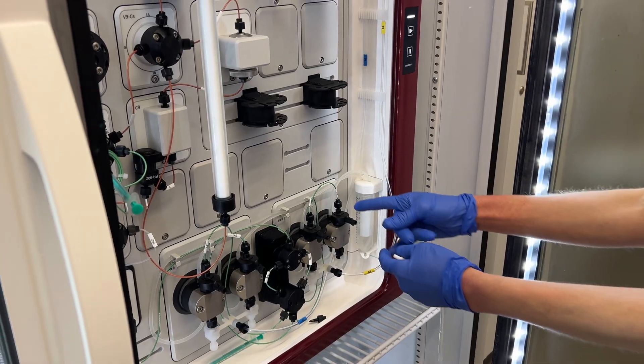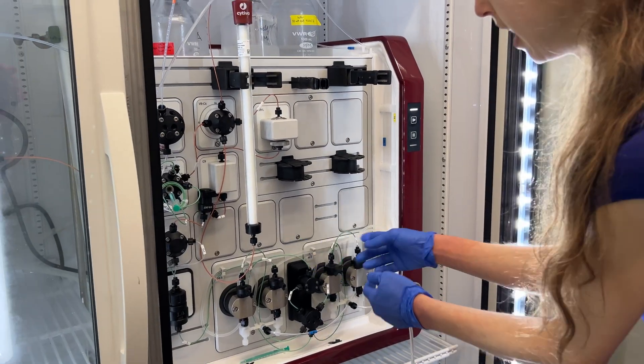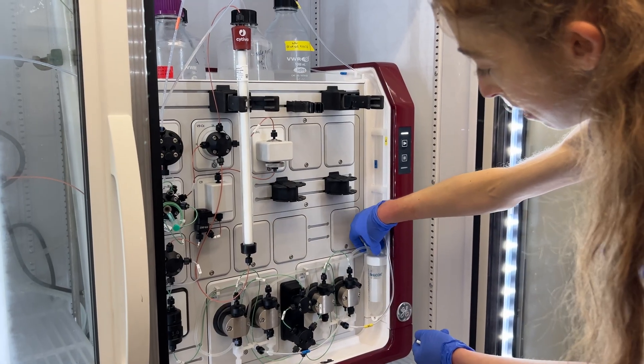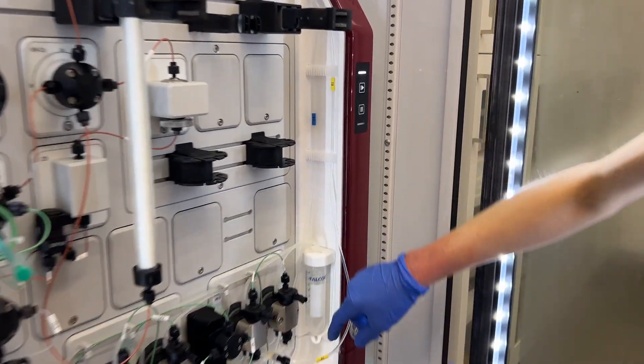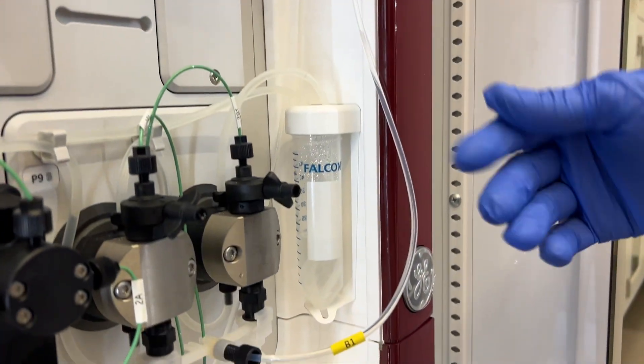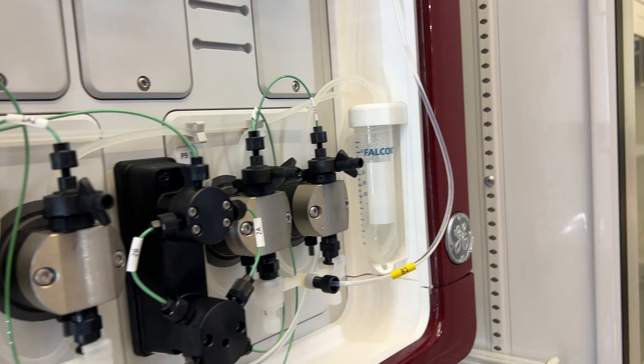When you do a pump wash, you should be able to see that liquid is flowing through these tubes. If it's not, you might need to check that the lines are in the ethanol, that the ethanol is filled, and pull out any air if needed.